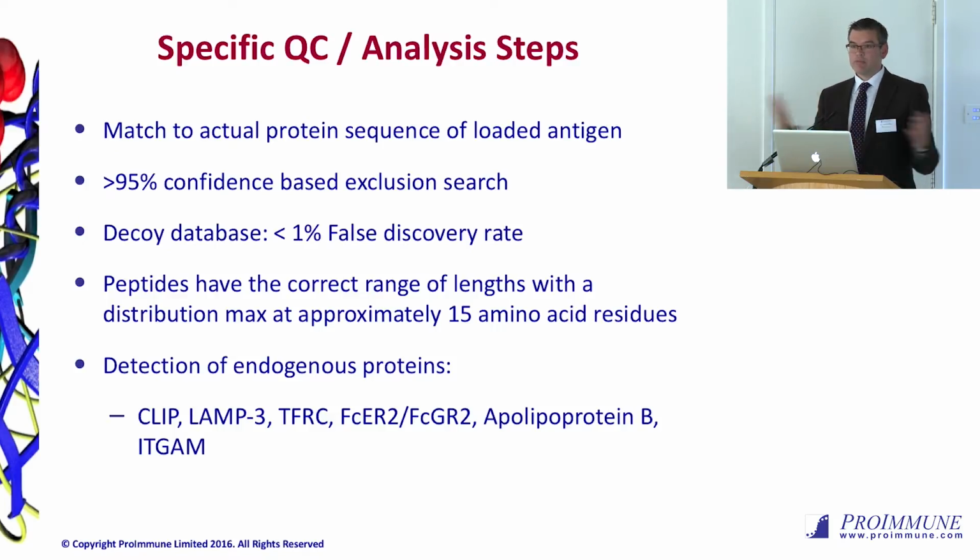So we need to know your, for example, antibody sequence. So here we take Humira. We take the sequence, we load it into a database. And the database is the entire human proteome. And on top of that, we take the sequence from adalimumab, and we're generating mass spectra from all the different peptides.